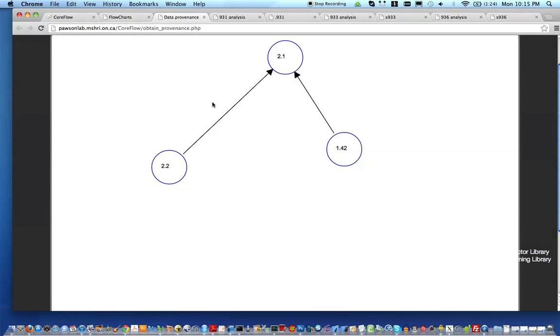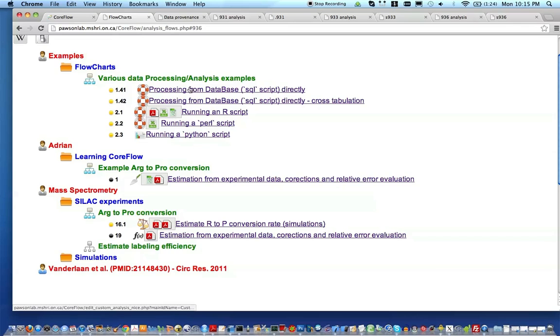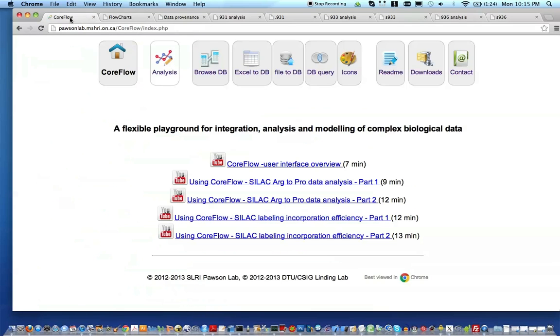This concludes mainly the presentation for today. This was just an overview of the interface. There are other elements to talk about later.